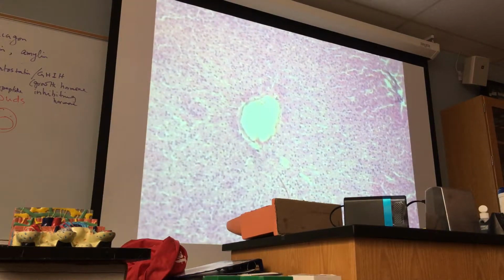Can you see this small? These are the blood vessels. These are the capillaries in the liver called sinusoids. Special capillaries because the endothelium is interrupted. You know, in classification of capillaries, you learned about continuous capillaries and discontinuous capillaries and sinusoids. Okay?